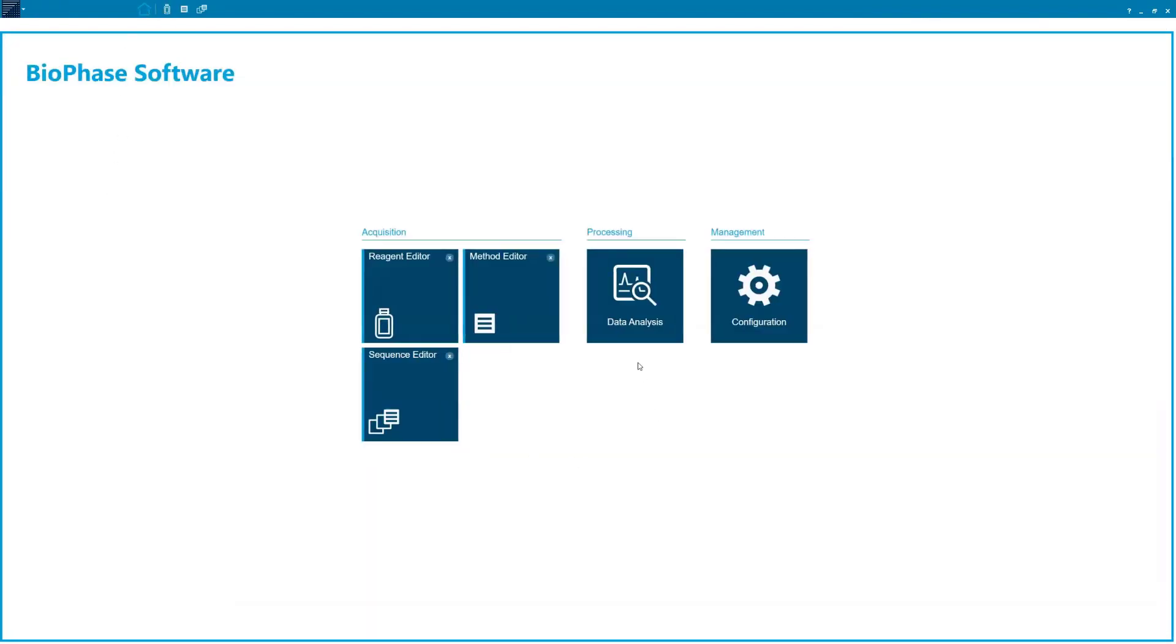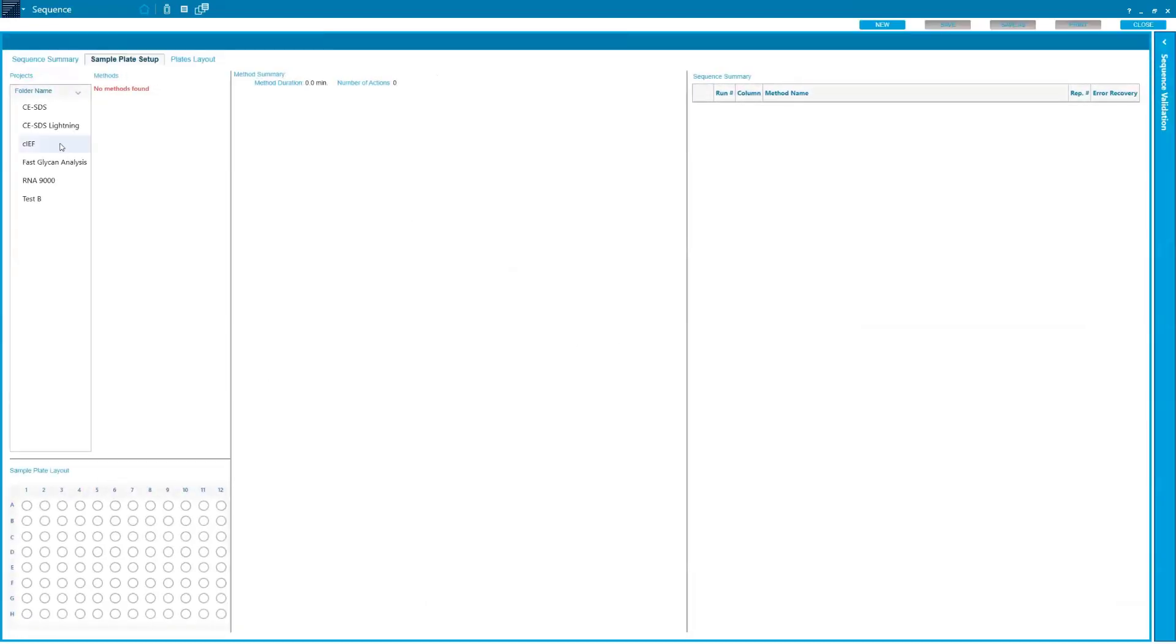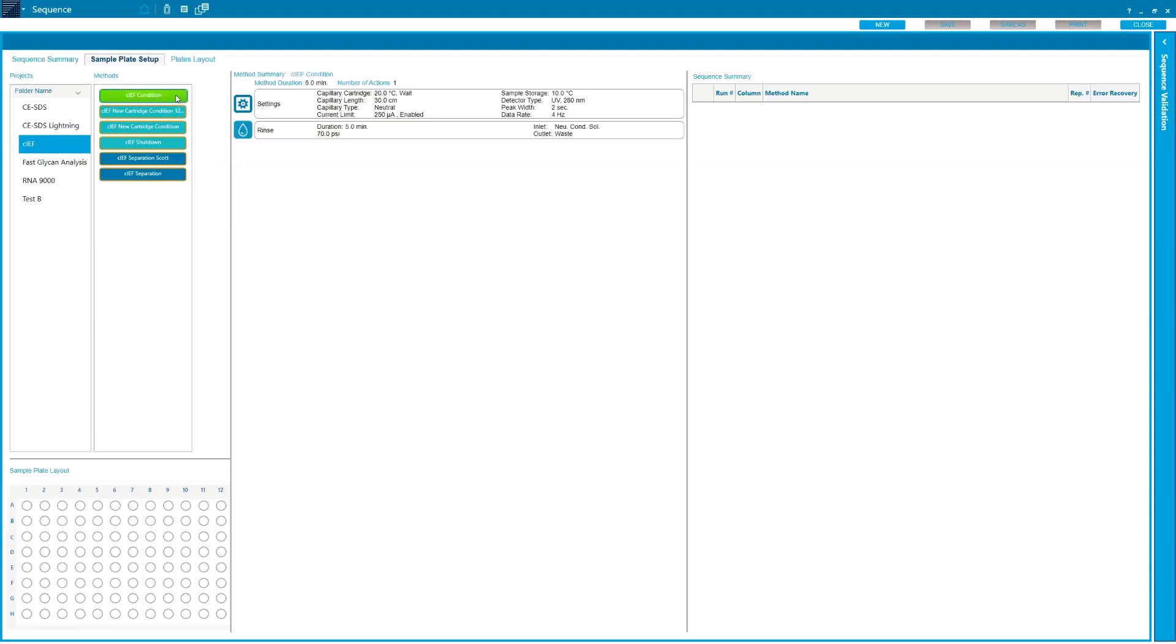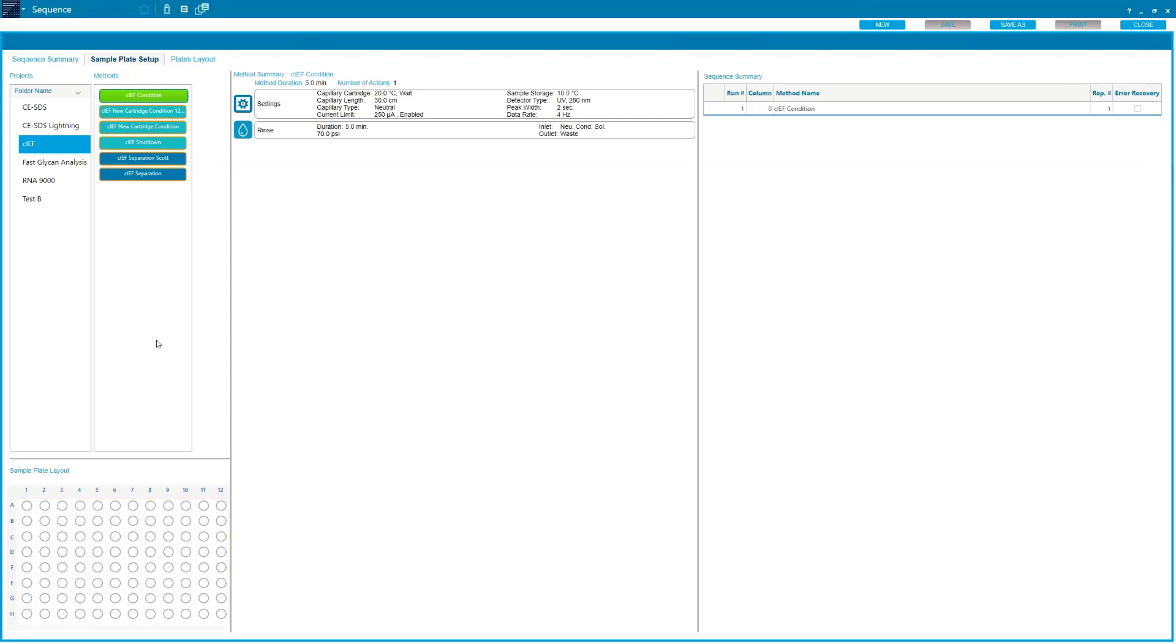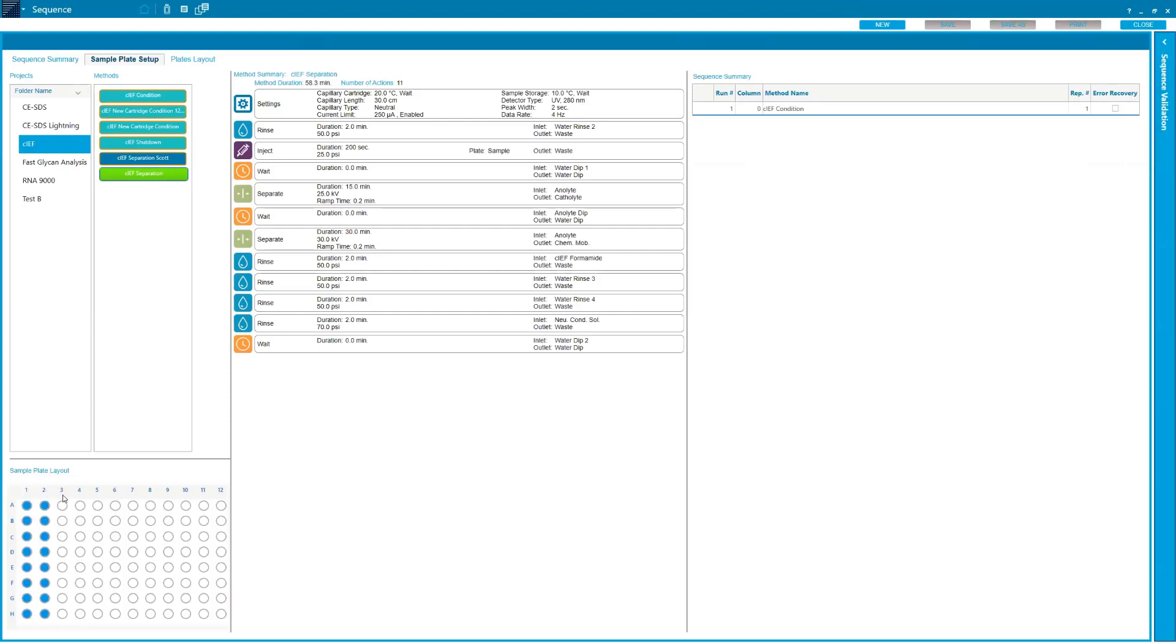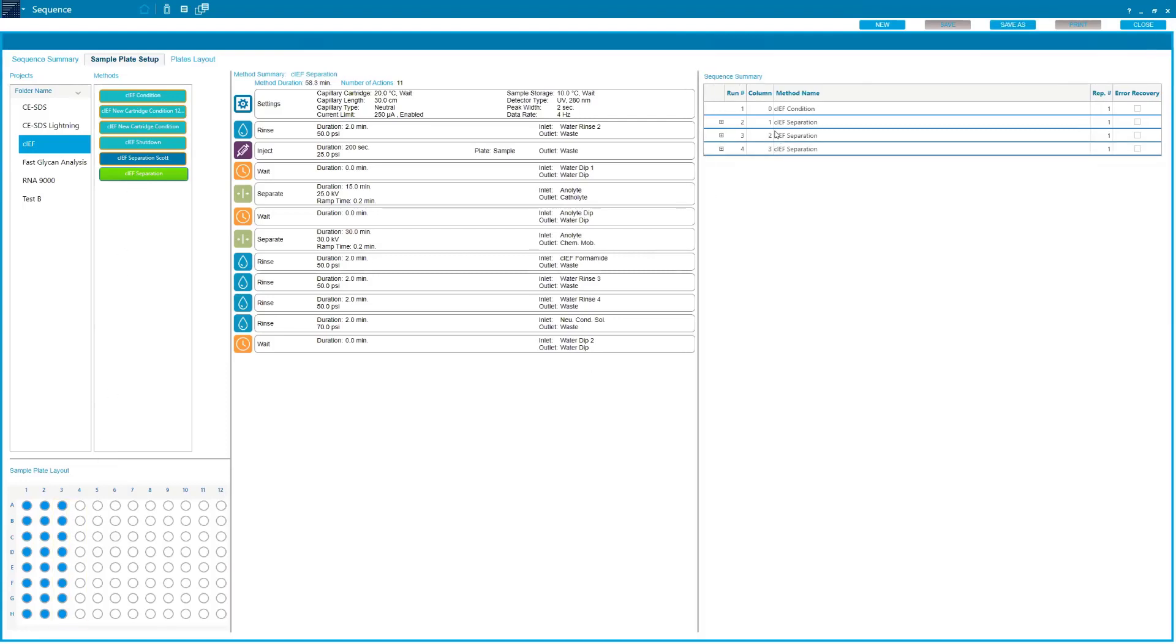Once we have that method saved, the next thing that we really want to do is create our sequence. We're going to start with a brand new sequence here. We're going to go over to our project folder that we have everything saved in. We'll see two different types of methods here. In teal, we have our conditioning and shutdown methods. The instrument knows this because we don't have sample injection. Here in the darker blue, we have our separations, and those are denoted because we have a sample injection. To load them onto our plate, all we do is drag and drop. We take it, we drag it down. Now we can see that our whole 96-well plate is highlighted or bordered in yellow because the conditioning method isn't affecting any one column, it's affecting the whole plate.